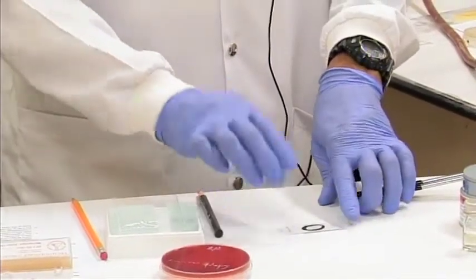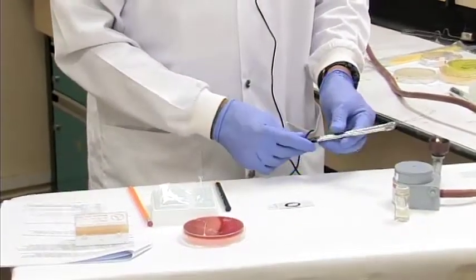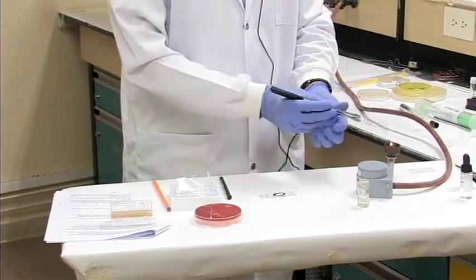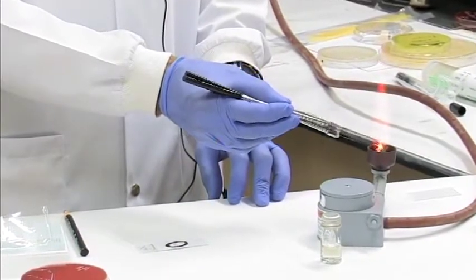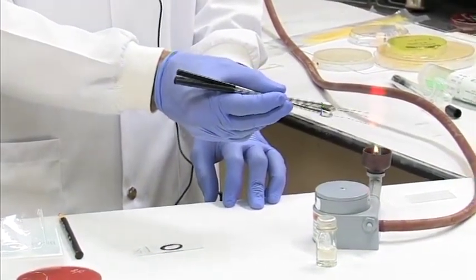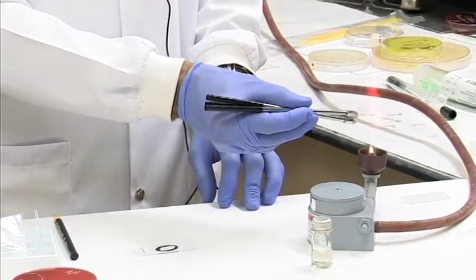So we have our slide ready, we have our bacteria, and we have our tools of the trade, our microbiological loops. These loops are metal loops, so you need to flame them and cool them before use. So we apply it to the Bunsen burner. Normally, apply it to the cool part of the flame first and then bring it up to the hot part where it becomes red hot.